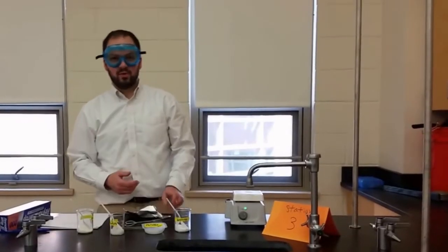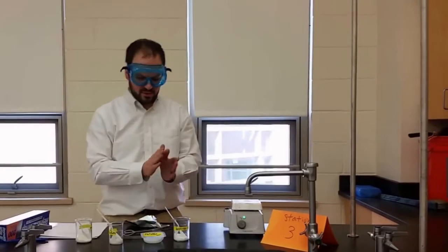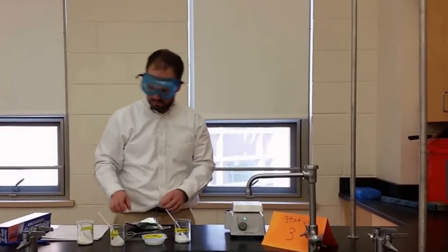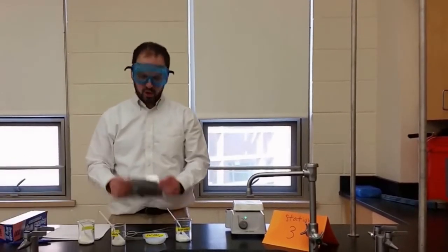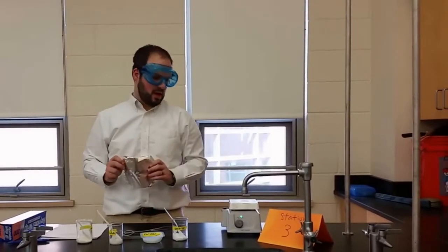Right, we're at station number 3 here, where we're going to be testing the melting point of different substances. We have 4 different substances at the station. We also have aluminum foil. You're going to want to rip off a small piece of aluminum foil that will be about the same size as the top of the hot plate.